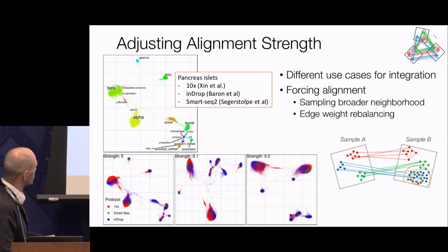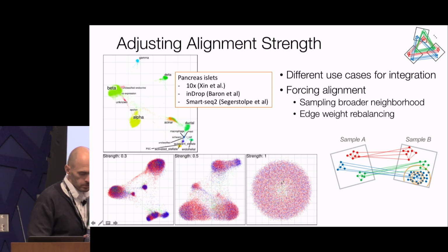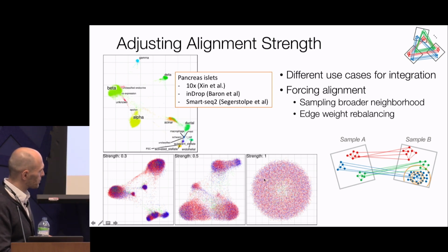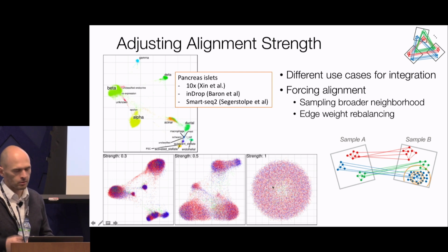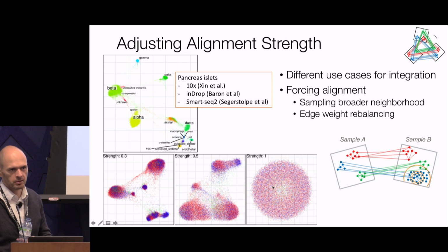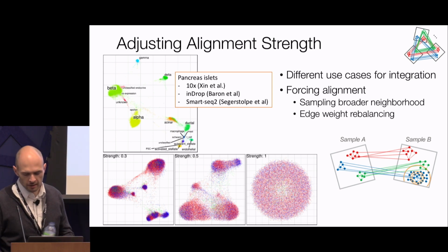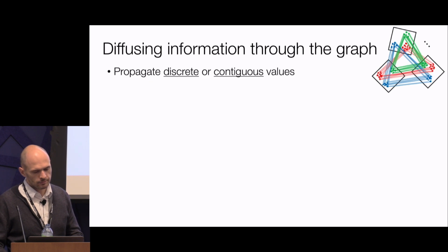So it's just a number that you can start to increase. Here I'm increasing it gradually, and gradually the mixing becomes a little bit better. Now again, just to illustrate the conceptual point, if I keep increasing it, it will become fuzzier and fuzzier, and if I set it to maximum, it will be this. Just to point out, what happened here is that I've asked the algorithm to explicitly generate perfect mixing between platforms. The only way to ensure perfect mixing is to lose all the structure of the data, right? So again, this illustrates the kind of balance that we constantly have. All right.